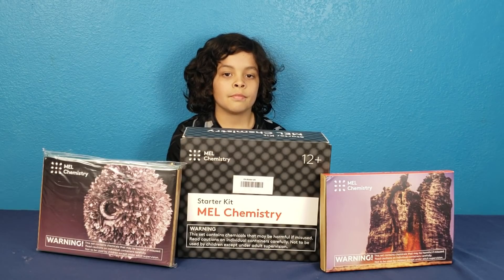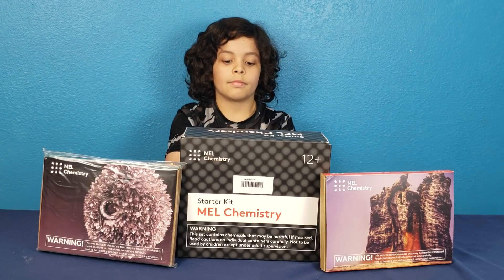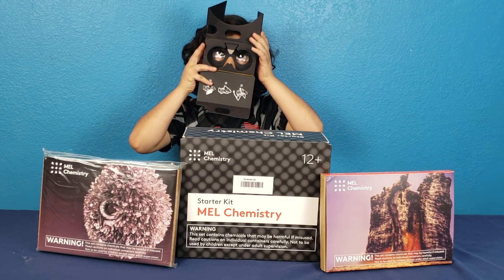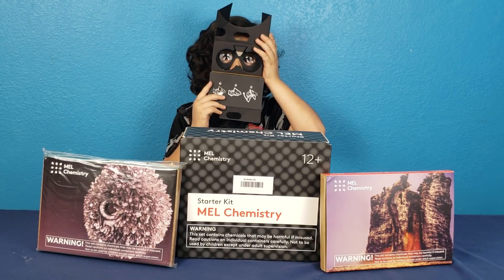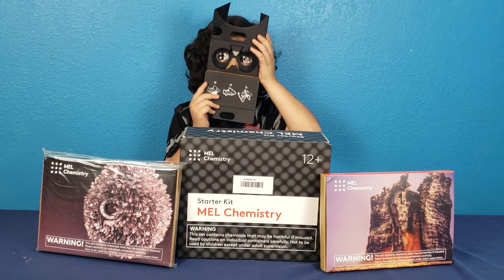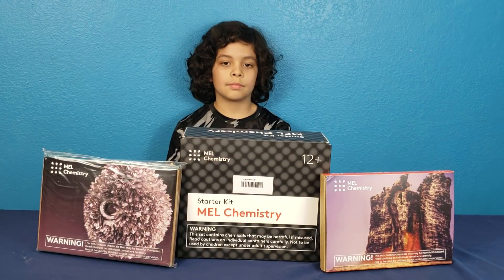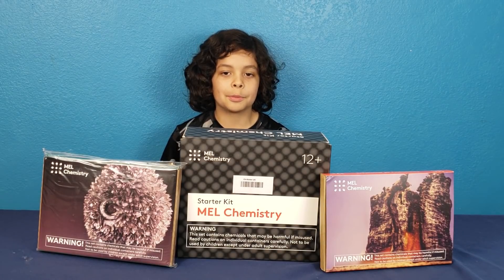Some of the features that come with this subscription are free access to Mel Chemistry virtual reality lessons. You put the smartphone in that box and it turns into a virtual reality box. Over 90 safe experiments in one subscription — I don't like unsafe experiments!